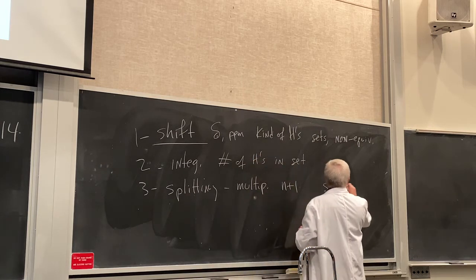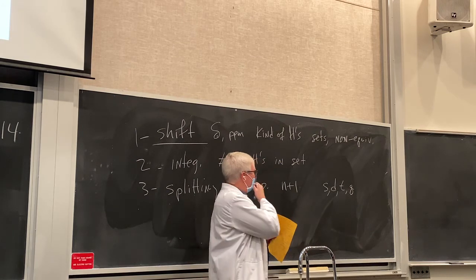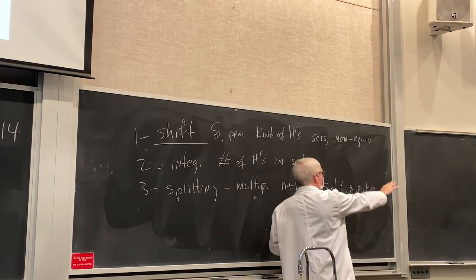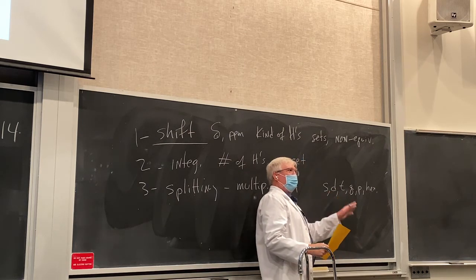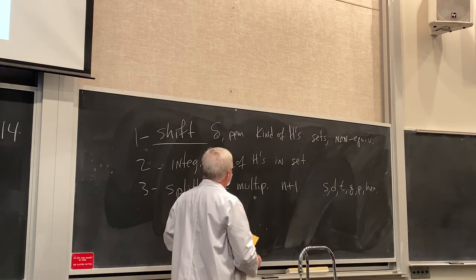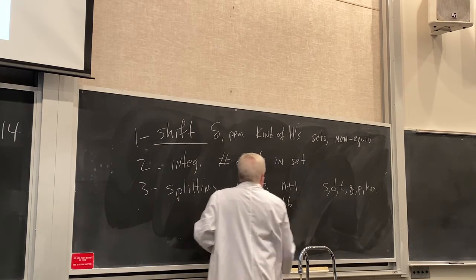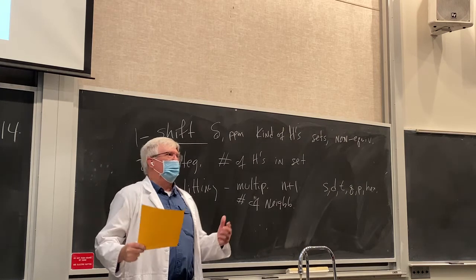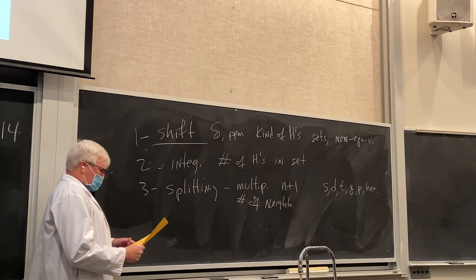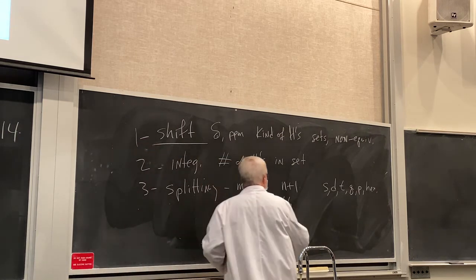And then if you've got two neighbors, it'll be a triplet, then quartet. Those are the common ones, doublet, triplet, quartet, when we got molecules that have multiple neighbors. And then we have pentet, we have hextet, and on up, but that's a lot more rare, okay? Usually then we're having a more complex pattern that has different things here. But this multiplicity then tells us what? The number of neighbors, okay? And that's a very powerful technique because then we can link up different fragments that we think about, okay? So it's the combination of these three things that let us know how this works. Okay, questions on it? Always keep this in mind, the basics of NMR and what we're talking about.